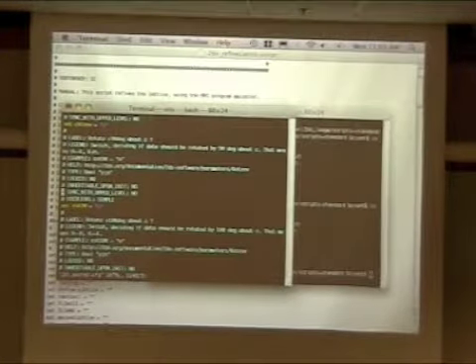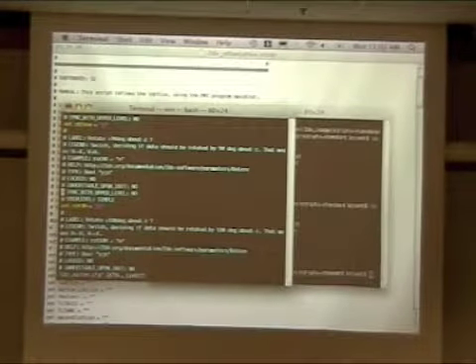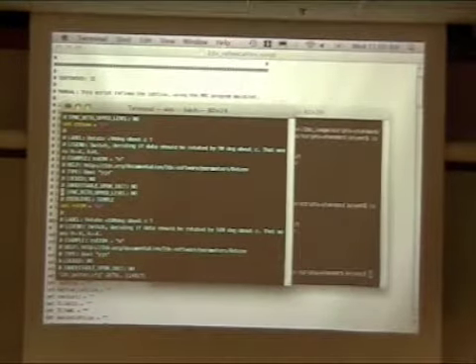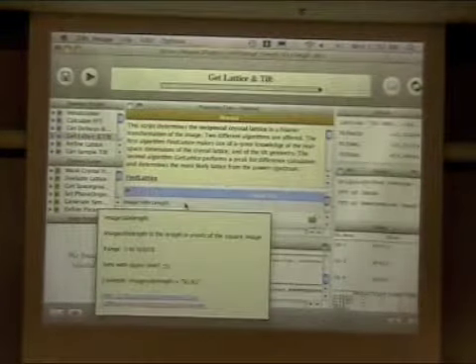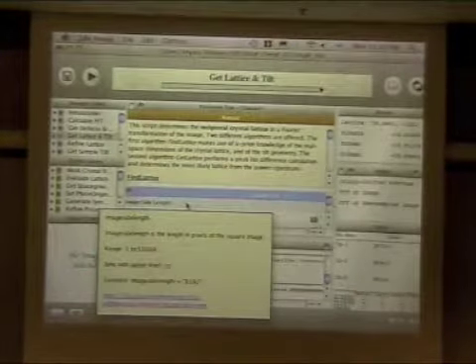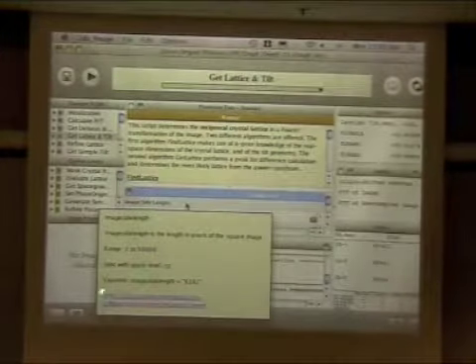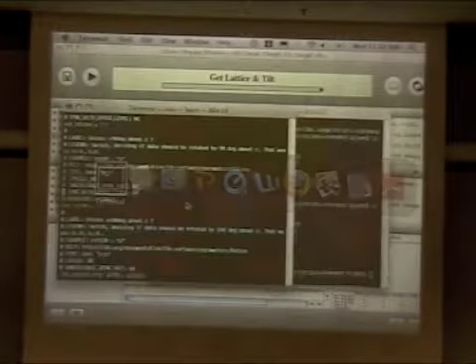So every variable that you might want to use that is commonly available to every script is going to show up here. And I don't know if I have time to go over what each of these things does, but in general, there's a label, there's a little legend that explains if you were to go into 2DX and right-click on one of these variables, much of what you see here is going to be defined, in fact, all of what you see is going to be defined in the configuration file. Most of them aren't actually necessary in defining a parameter, but they're quite nice. There's even a link to where you can go for more help if you like.